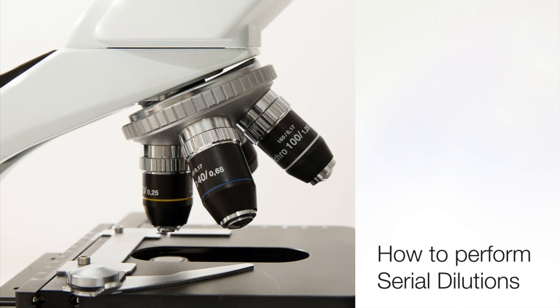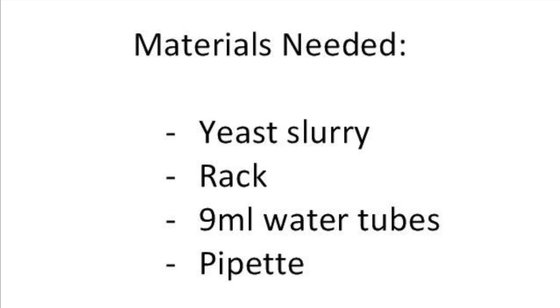In this video we will discuss the procedure for serial dilutions. The supplies needed are as follows: yeast slurry, rack, 9 mL water tubes, and pipette.